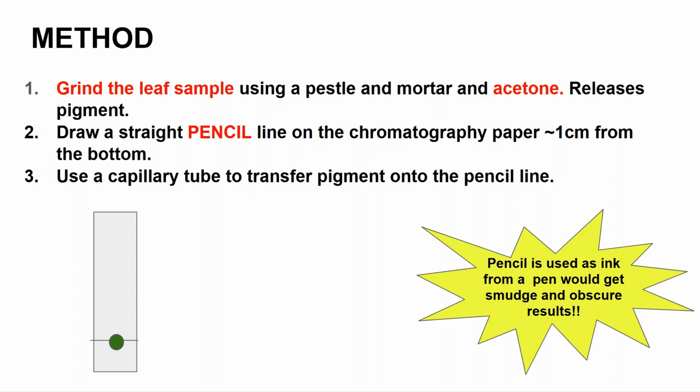As I said, it's really important that you use pencil to draw your line. This is something that is sometimes asked in exams: why is the line drawn in pencil? This is because if you used ink, that would smudge, because it would leak, and that would obscure your results, because you might misinterpret the ink smudge as a pigment.